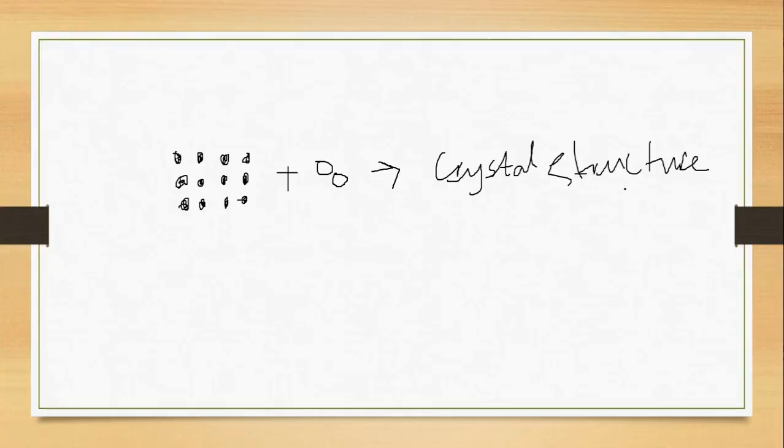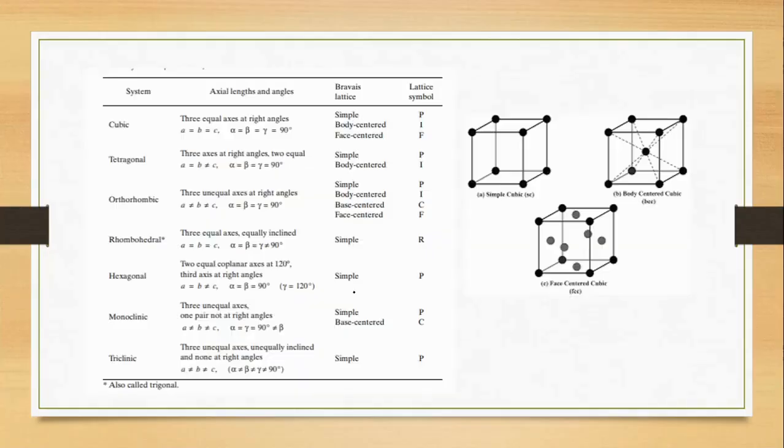So from here, we can apply all these different operations, and we'll get the following results. As you can see, these are the 7 crystal structures. These are systems. This is all the different angles and lengths. So these are your lattice parameters. This is the angle, and this is what it looks like here. These are the Bravais lattices.